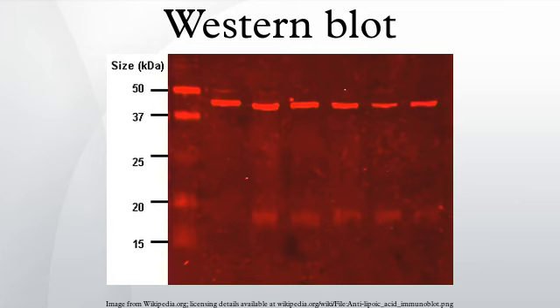Chemiluminescent detection: chemiluminescent detection methods depend on incubation of the Western blot with a substrate that will luminesce when exposed to the reporter on the secondary antibody. The light is then detected by CCD cameras which capture a digital image of the Western blot, or by photographic film. The use of film for Western blot detection is slowly disappearing because of non-linearity of the image. The image is analyzed by densitometry, which evaluates the relative amount of protein staining and quantifies the results in terms of optical density.